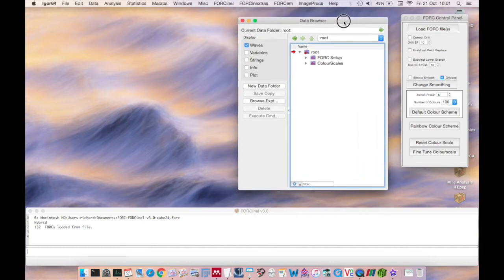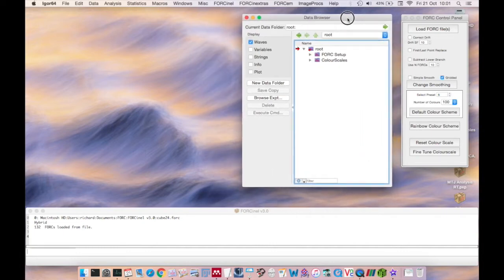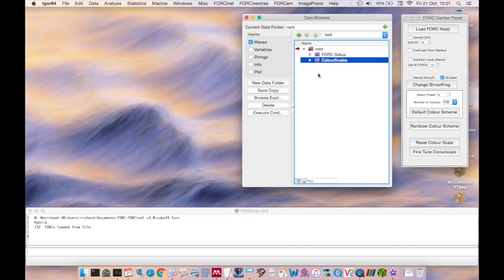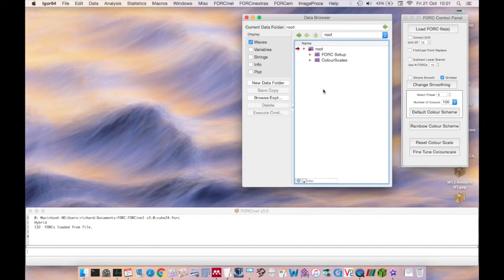Lastly there is the Data Browser. This contains some key data folders used internally by ForkNL, such as the Fork Setup and Color Scales data folders. Do not delete these or ForkNL will not work properly. The Data Browser will eventually contain a separate data folder for each of the fork data sets that you've loaded in.